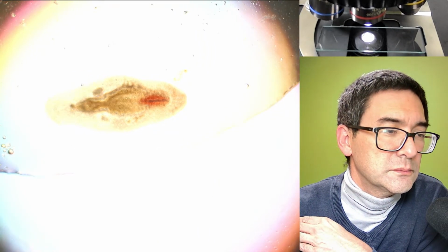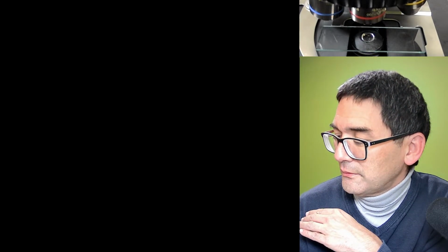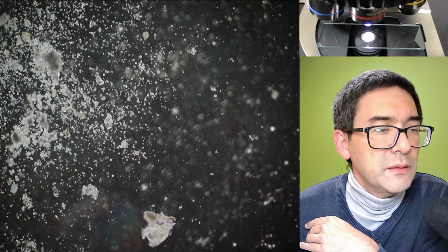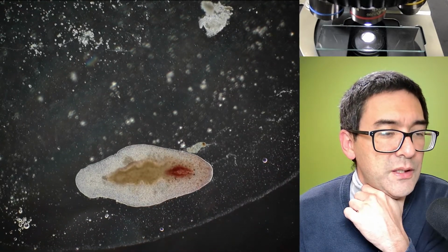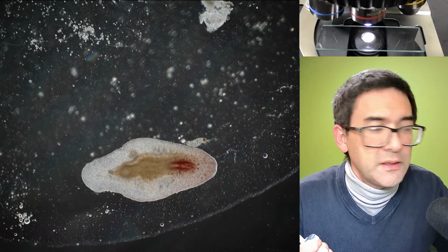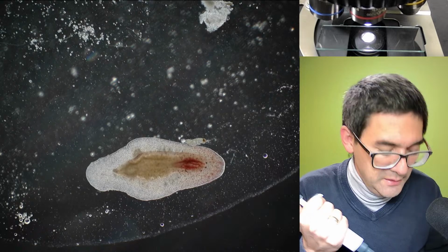Maybe the flatworm is not doing so fine after all. Or could it be because there is still plenty of liquid here? Interesting. Let me check if it's the amount of liquid. Yeah, but I see that there's still quite a bit of liquid present.